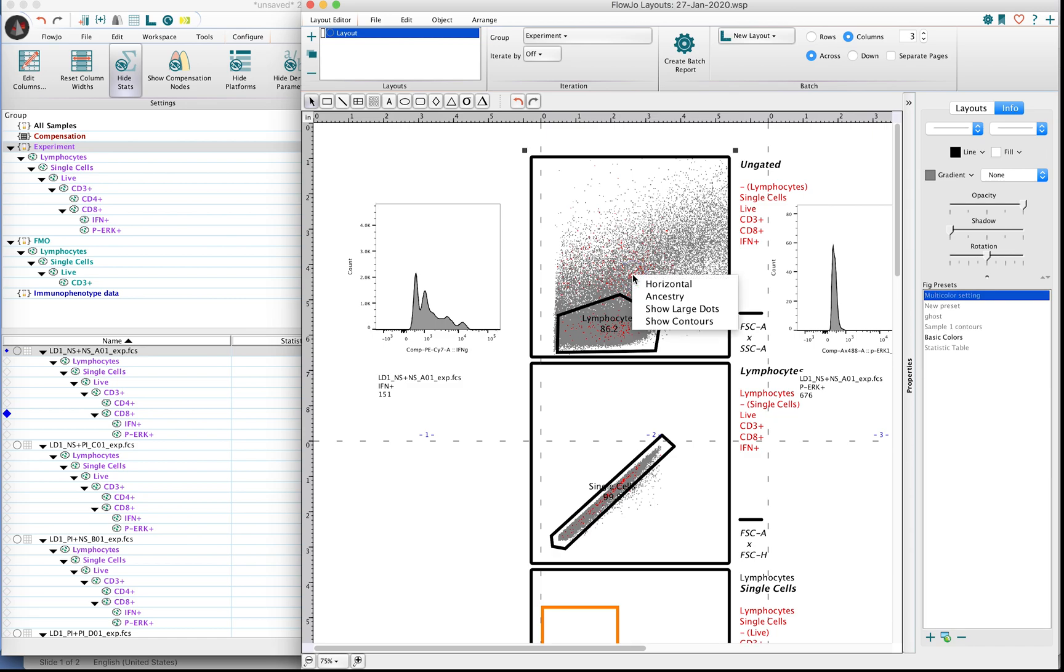And in fact, if you right click on the pane itself, you can change the visualization of this pane, again moving it either horizontal or vertical.